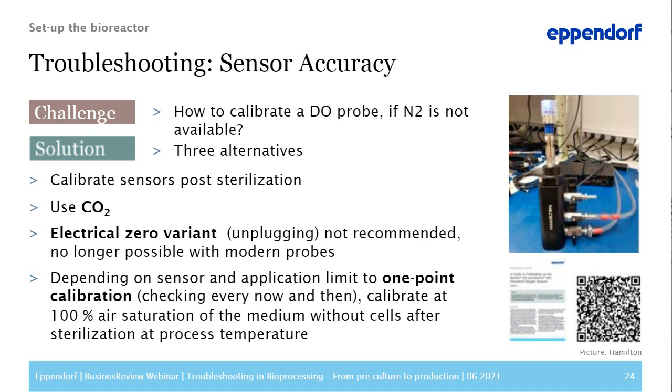All in all, always calibrate the DO sensor after the sterilization at process temperature and agitation that you will use in the run. Here's another QR code for you that will guide you to our application note, which is a brief DO calibration guide.